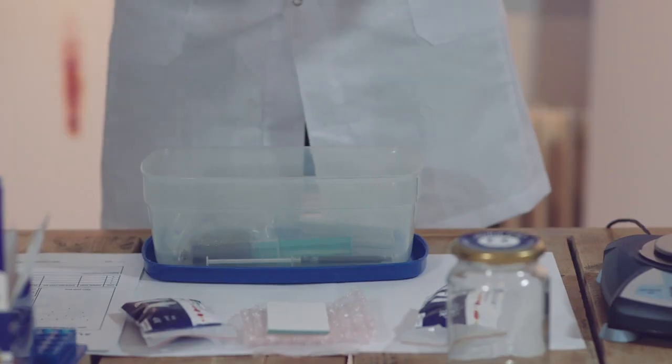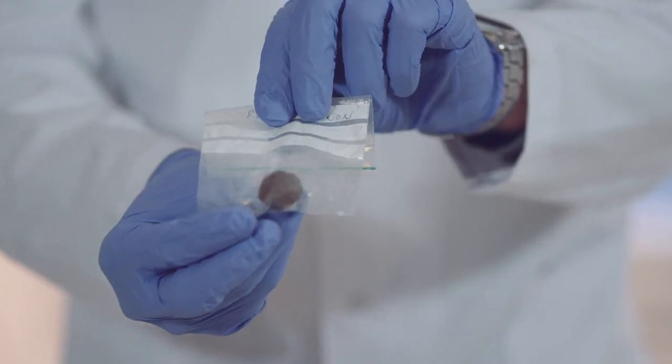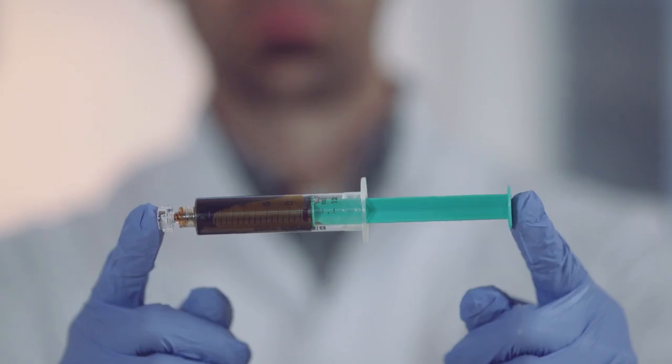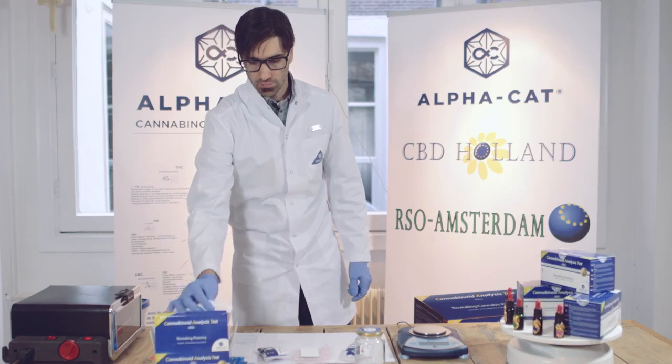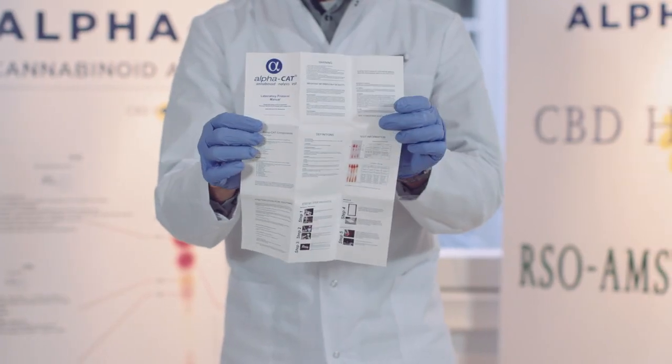For this video tutorial, we will test four different samples: raw herb, hashish, RSO oil, and CBD extract. You can test up to four samples for each plate. Take the tutorial and follow the instructions.